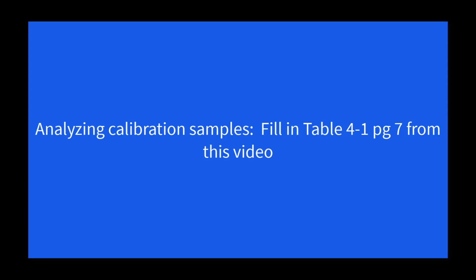So during this video, what we're going to do is use the samples you prepared in the last video, the calibration samples, and you're going to actually analyze them and get the absorbance, and we're going to use those numbers to turn that into a calibration curve.